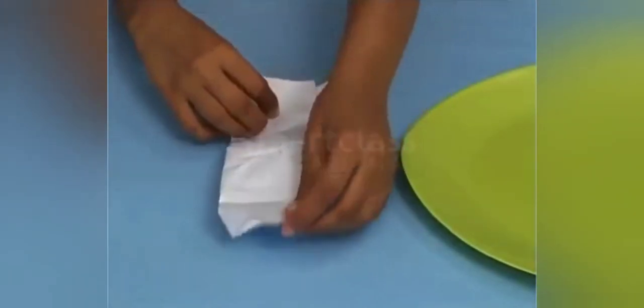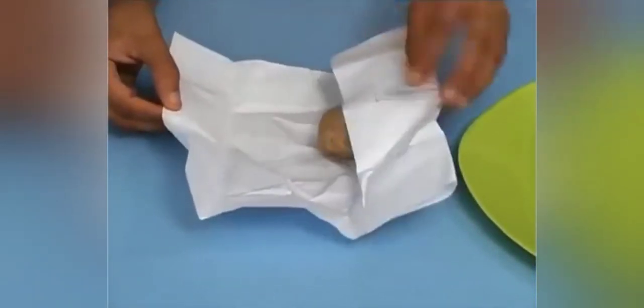Now straighten the papers and remove the food items from them.